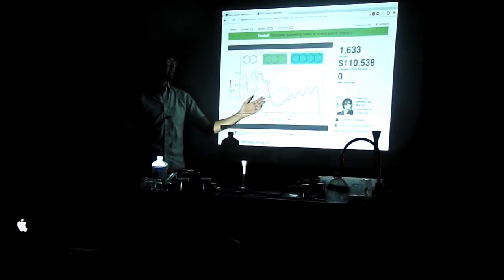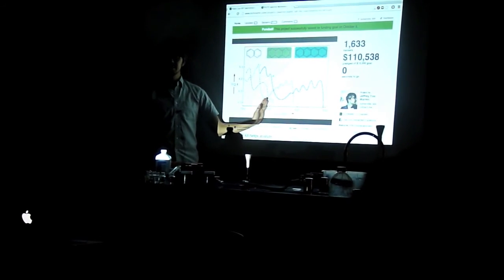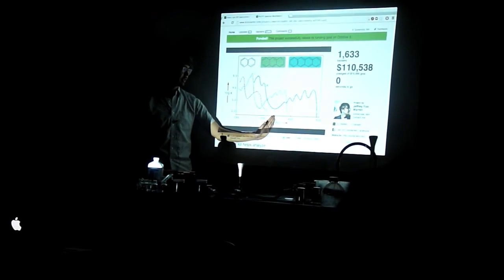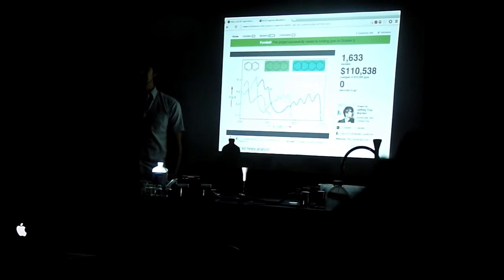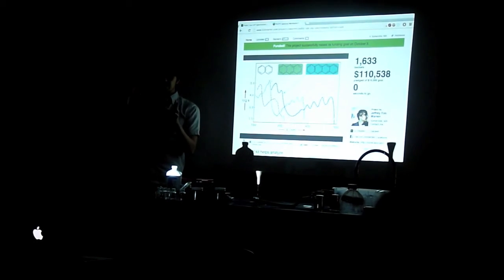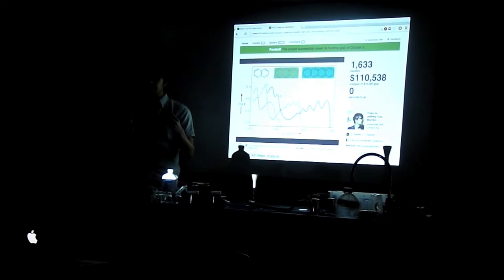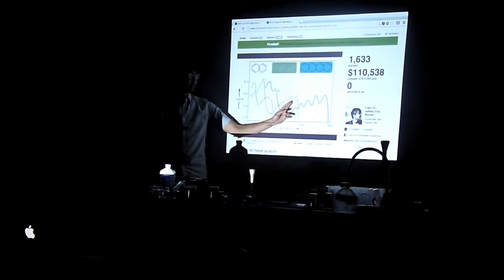So this is actually a lot of ultraviolet data, and we can't necessarily get it. People on the spectrometry list, the Public Lab spectrometry list, are very optimistic that we can get all the way down here. But for the time being, we're really looking at here up. So the dream, the awesomeness, would be if we could set our spectrometers up in a completely dark space, line them up, have a lot of light coming in, and detect these kinds of waves.